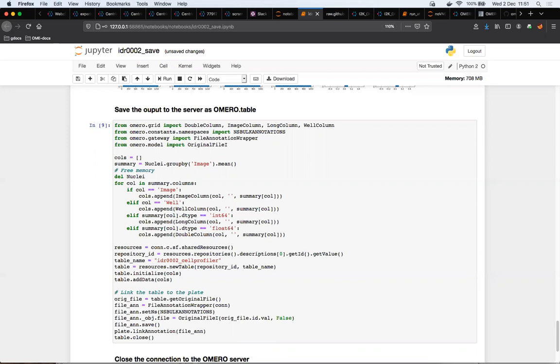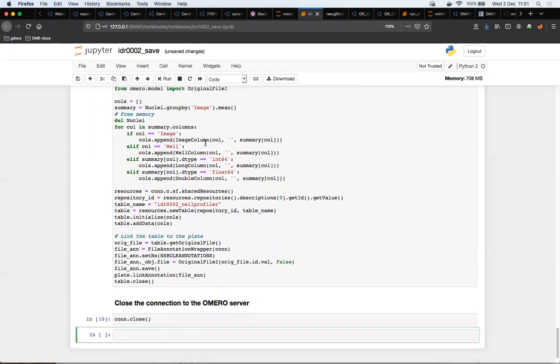The advantage compared to a CSV file is that you can also query it afterwards, as Peter will show in the UI. You can say, okay, give me all the analytical output that has, I don't know, values greater than 5, for example, and then you can extract that. That's why saving the result into that structure offers you much more flexibility when you want to mine the data, mine the analytical result.